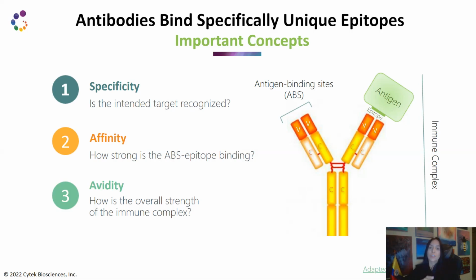Avidity, also the overall strength, so depends on affinity, but also on anything else that can help stabilize the complex. Things like how many antigen binding sites are present in the antibody, how many binding sites in the antigen, anything that could help the molecules interact, things like having your antigen immobilized, and other factors, more technical ones like temperature, time of incubation, and staining conditions.